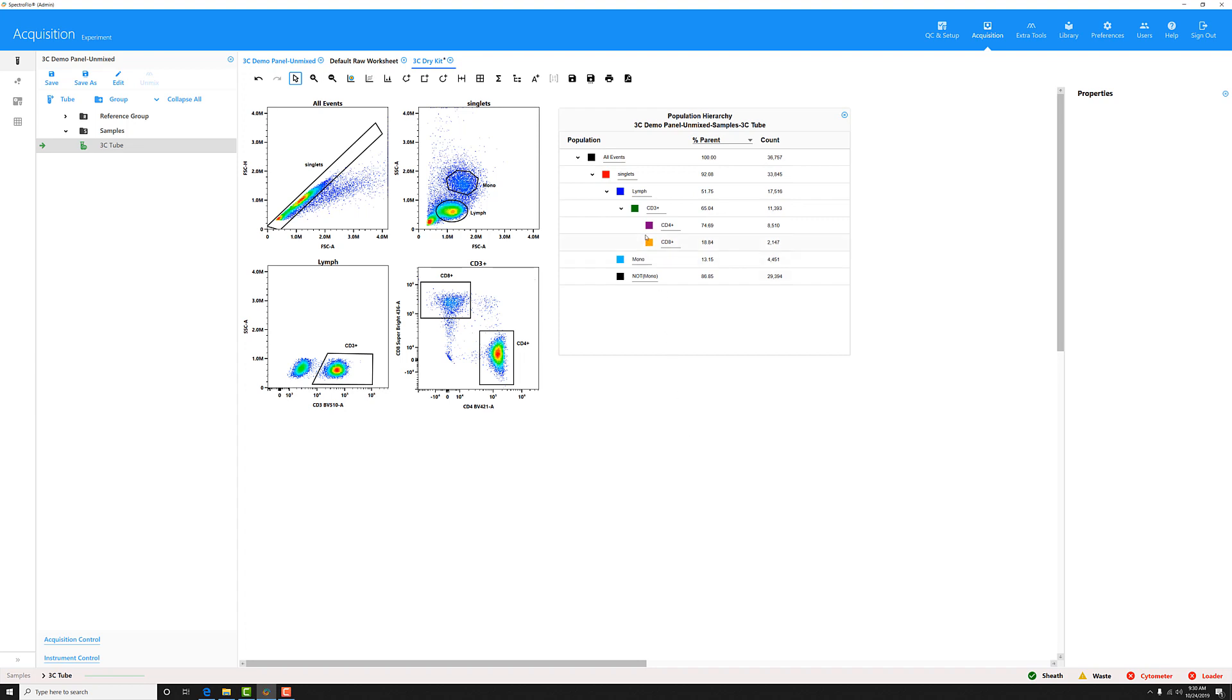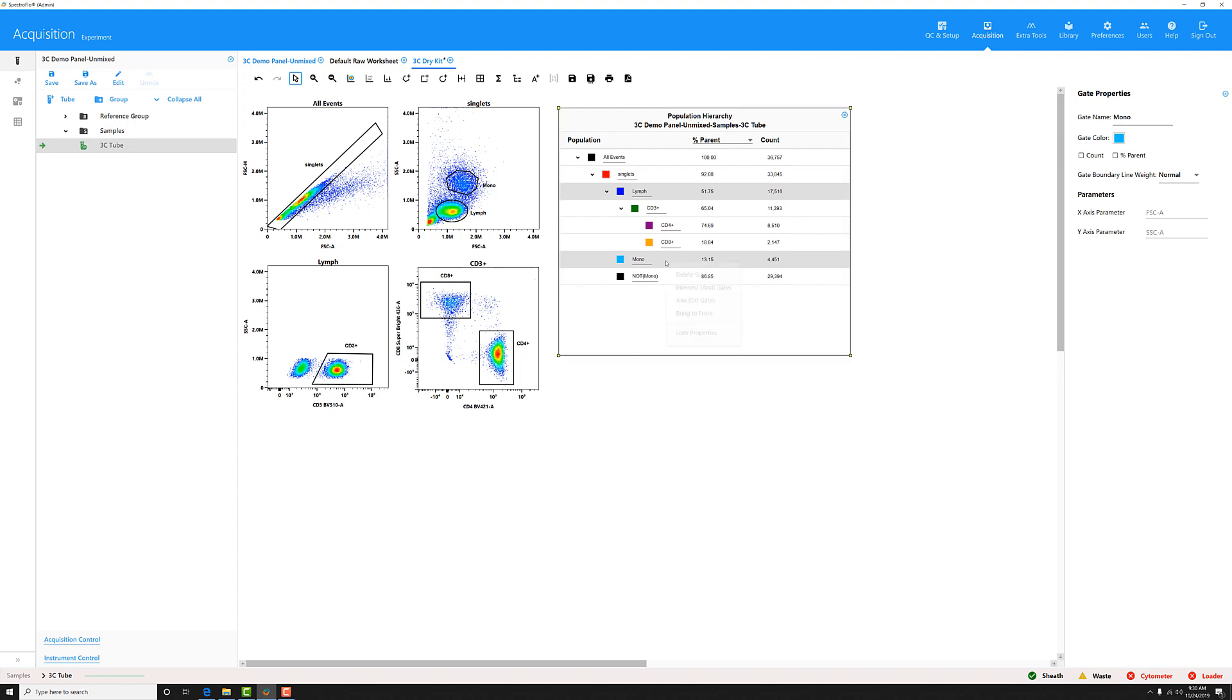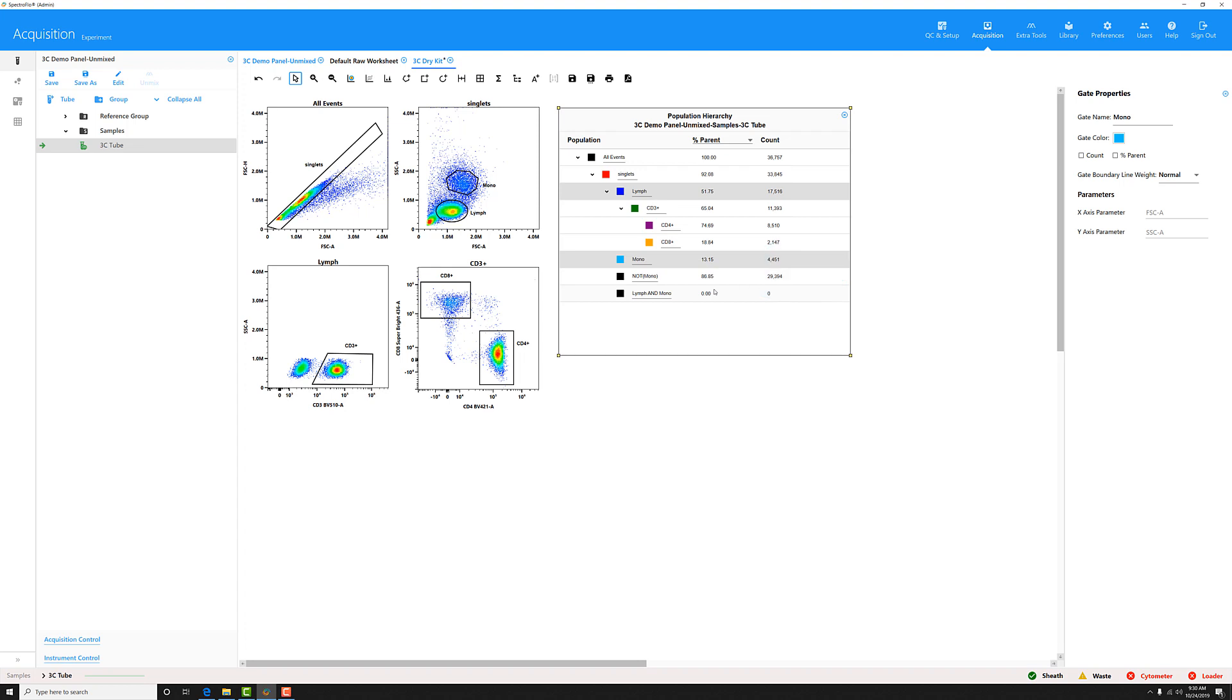Then, say for example, I want to make an AND gate off of my LIMP gate and my MONO gate. I can hold the CTRL key and select both of those, then right click and select intersects AND gates. And you can see the gate appears here in the population hierarchy.